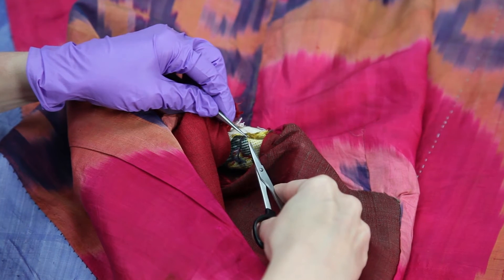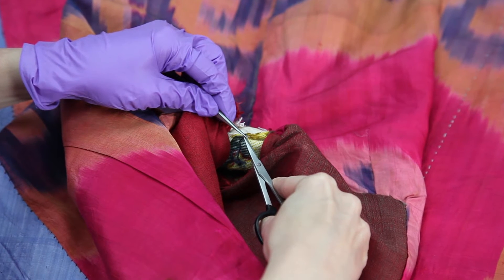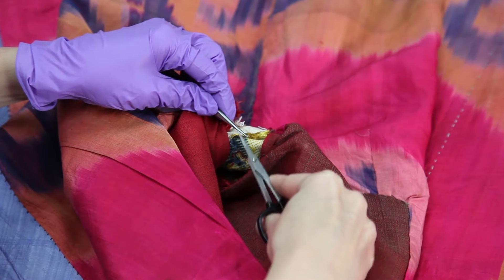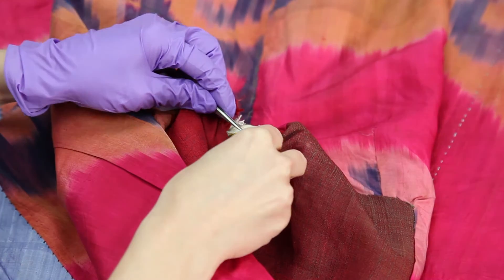We try to do non-destructive analysis in conservation, but when necessary for dye analysis we do need to take just a small sample of threads. Using tweezers used for surgery and sharp tiny scissors, I'll take a sample that's maybe two millimeters long, and that's enough for the conservation scientists to hopefully determine what the dyes are.